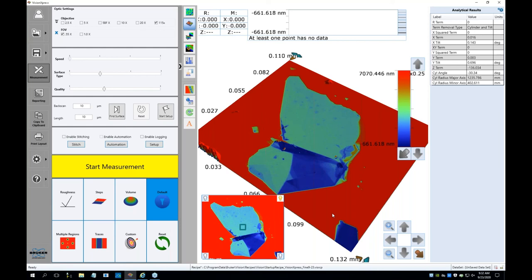There is an inherently sub-nanometer vertical resolution, such that we define every point in 3D space with a very high vertical resolution. So if we repeat the measurements and use a correlative algorithm, such a vertical resolution will help us refine the lateral resolution down to the diffraction limit, such that we can really see 200 nanometer details. And speaking about lateral resolution, whenever we say we reach up to 150 nanometers lateral resolution, this means we can resolve two lines separated by 150 nanometers.